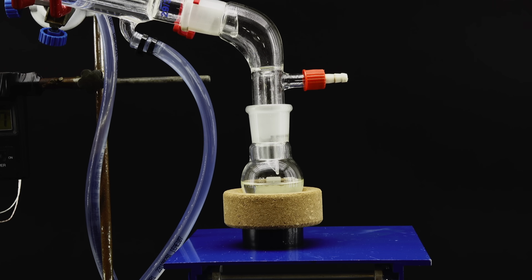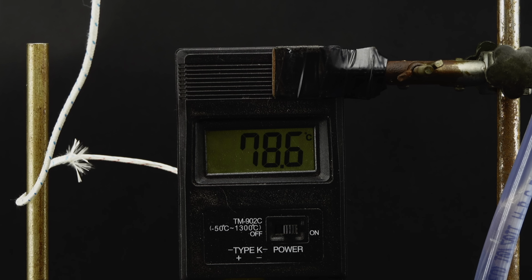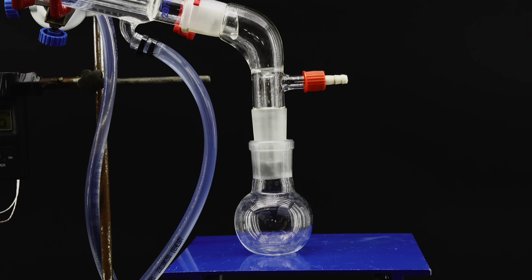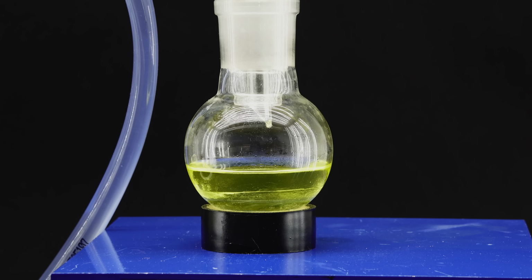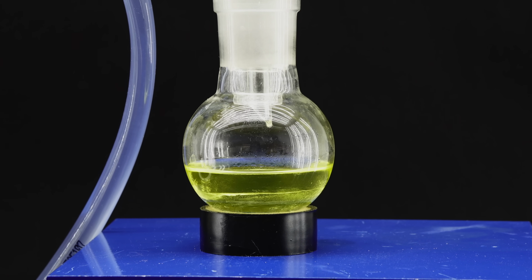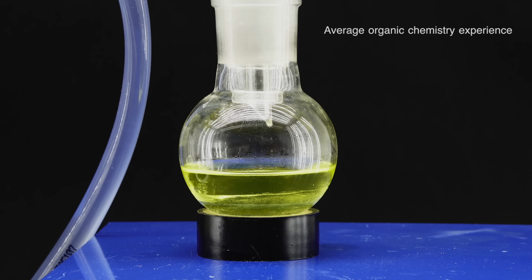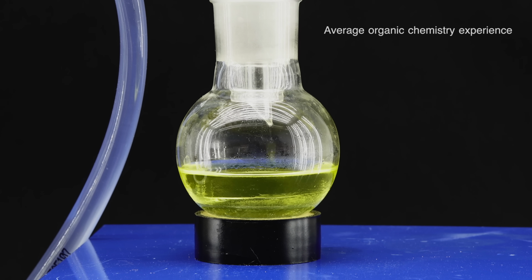Anyway, when the receiving flask was almost full, I replaced it with a bigger one, and since the temperature of the vapors started rising, I should now begin to collect some drier, purer benzene. At first, it was exactly what happened, however, after a while some weirdly yellow liquid started coming over with my benzene. This is basically another installment of the curse of yellow, which I always seem to suffer when distilling things, and it means that there is some volatile impurity mixed in with the benzene.